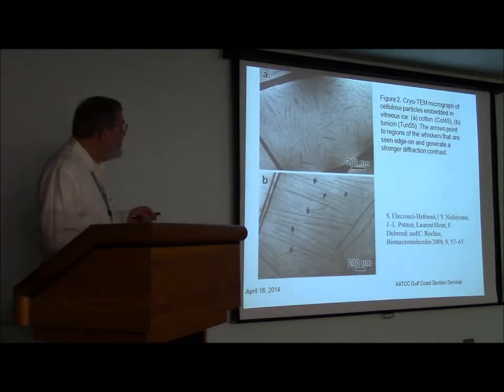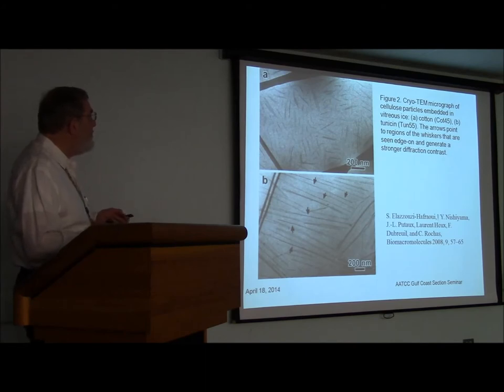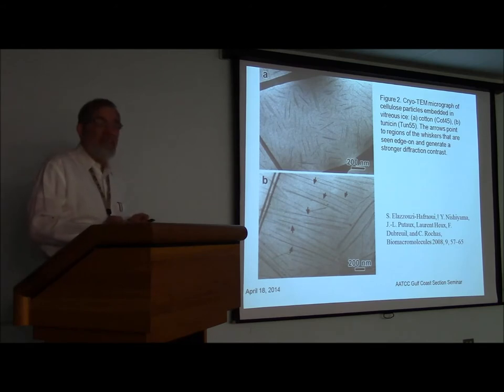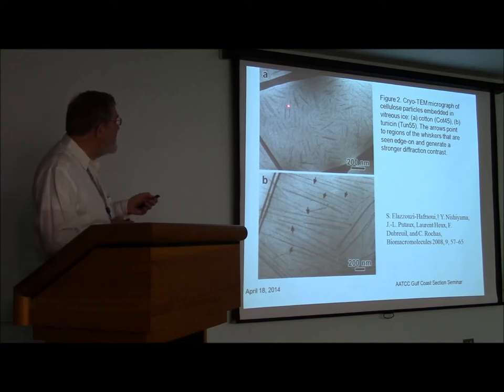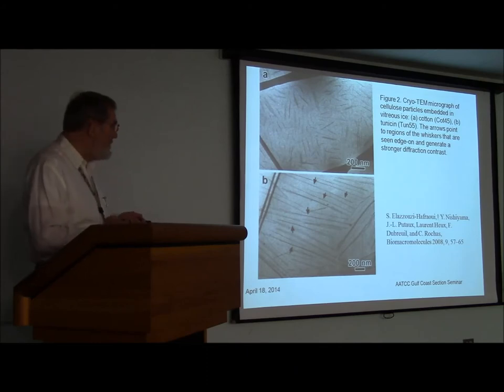And here are some pictures of transmission electron micrographs of cellulose particles that were isolated by acid treatments of tunicate in the lower picture, and cotton in the upper picture. You see these long fragments here. This is some work from the CERMOV in Grenoble, France, my good colleagues there, published in Biomacromolecules back in 2008.